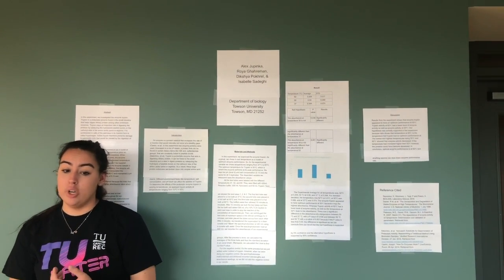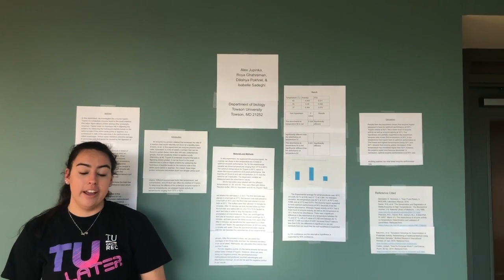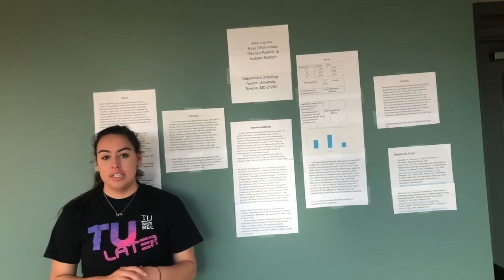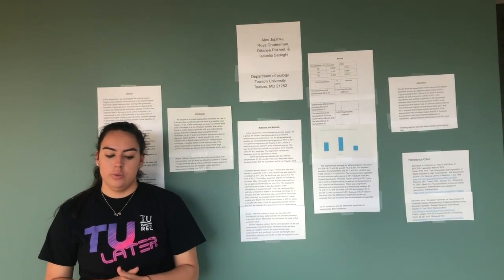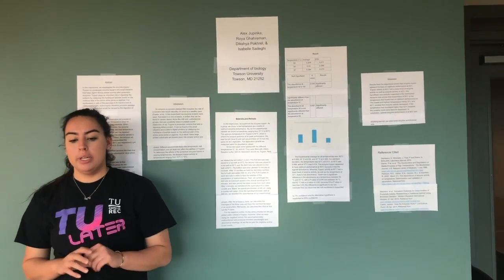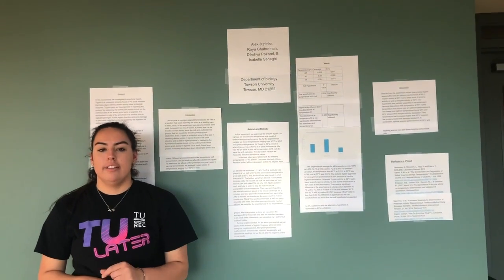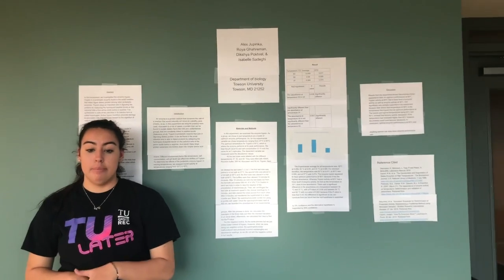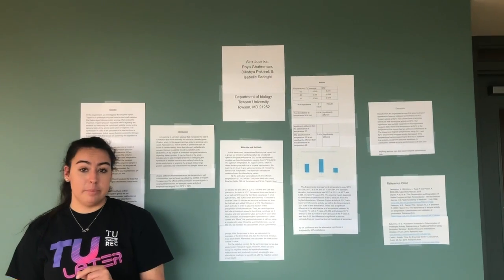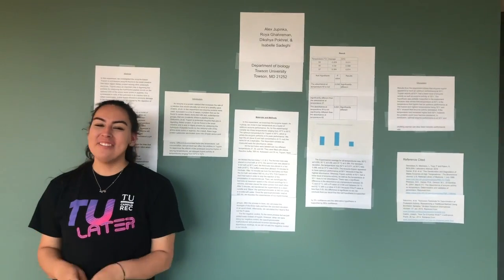Our experimental design was adequate to test our hypothesis. However, our execution was not. We had errors mainly with maintaining the temperatures of our water baths and with our spectrophotometer. So our hypothesis was partially supported by the experiment because we did show that 50 degrees Celsius is the temperature that trypsin has an optimal performance at. But we were incorrect because the highest temperature that we tested did not have optimal performance because it denatured the enzyme.